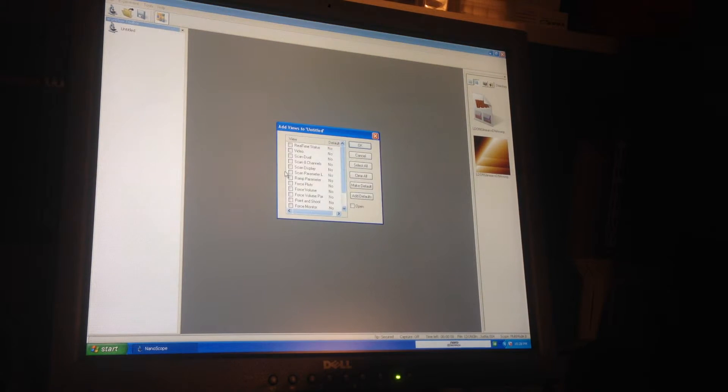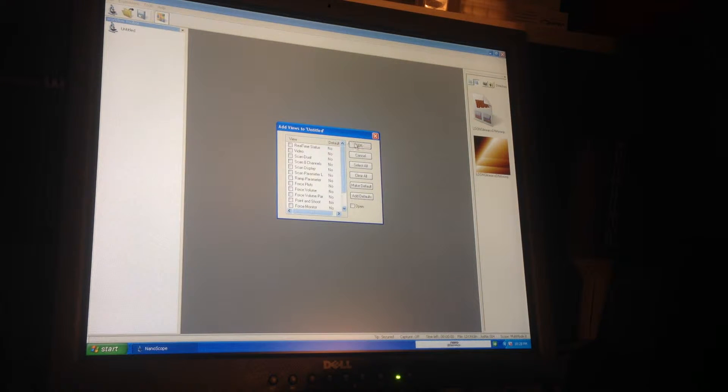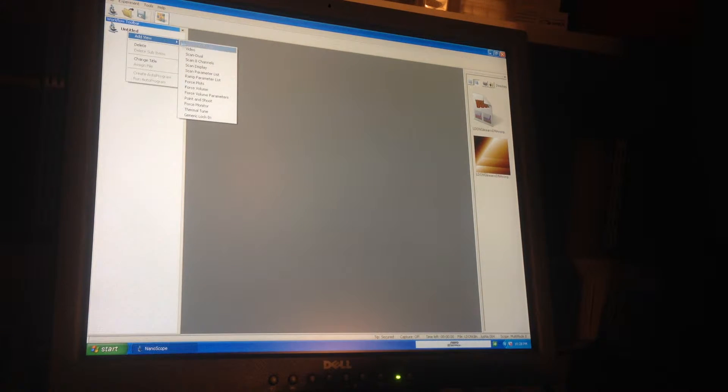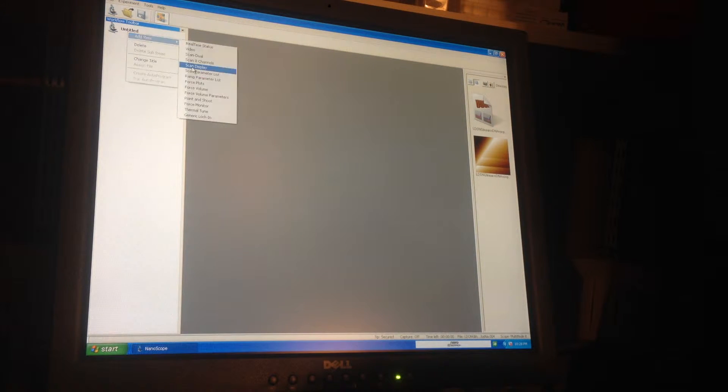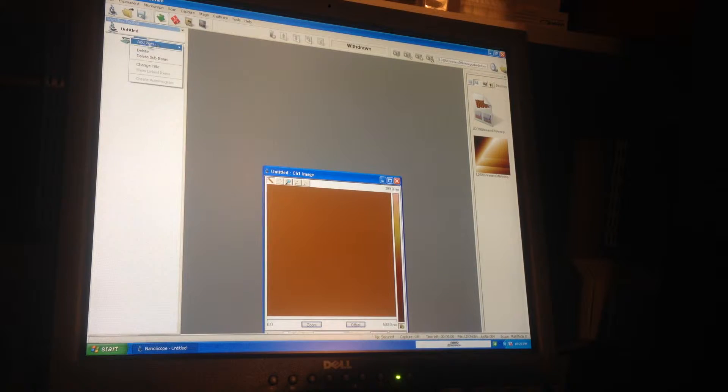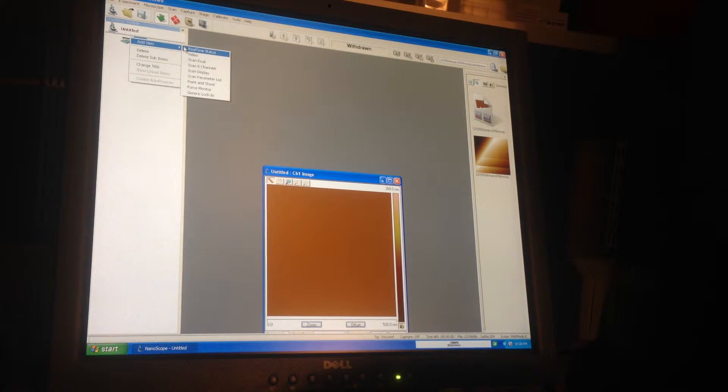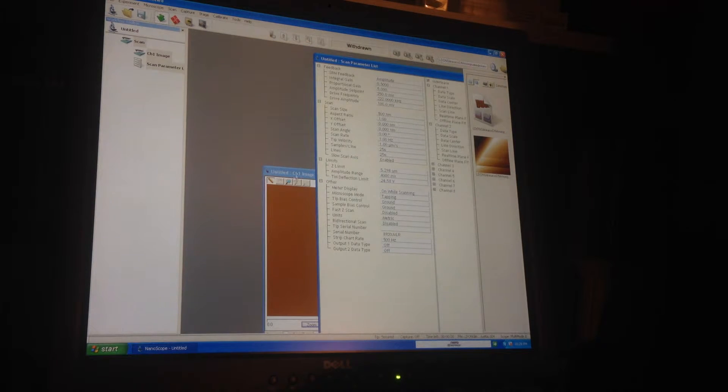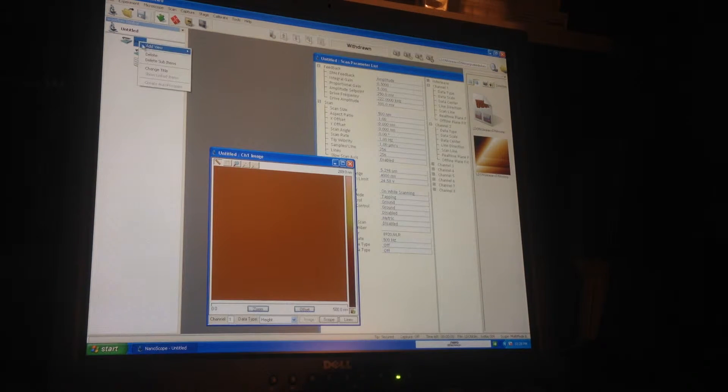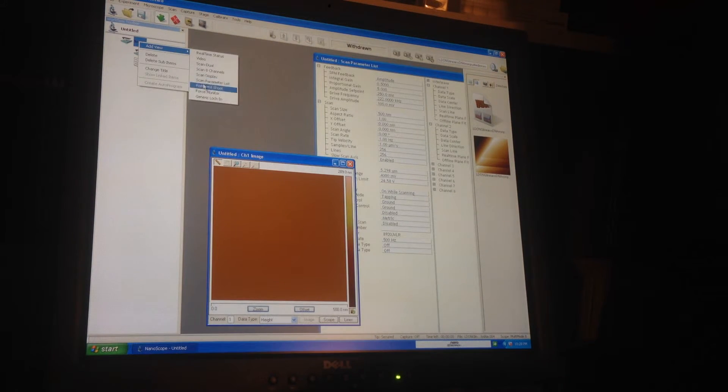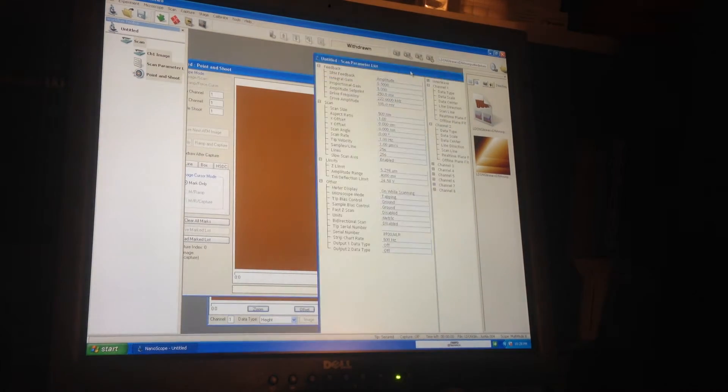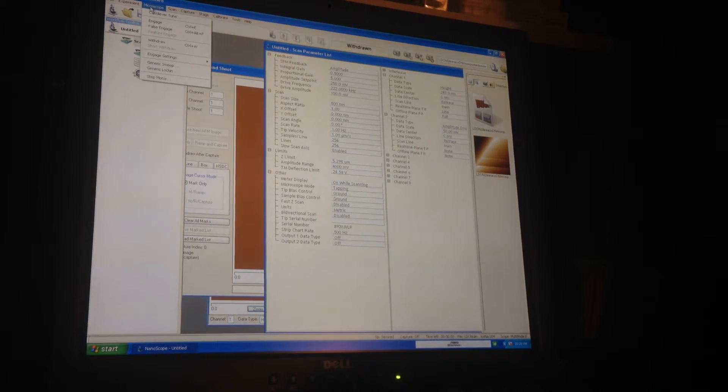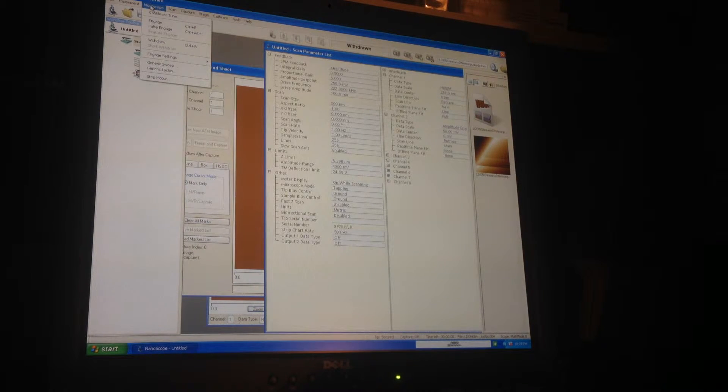I have a log, so add view and I'm adding scan display, scan parameter list - there's another important one - and point and shoot. Those are the three I'm going to add.